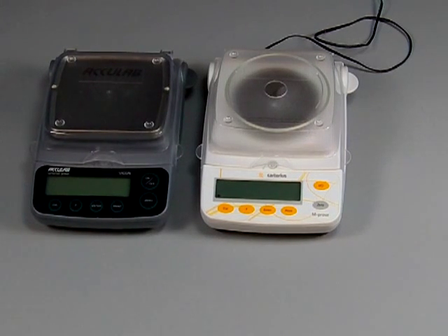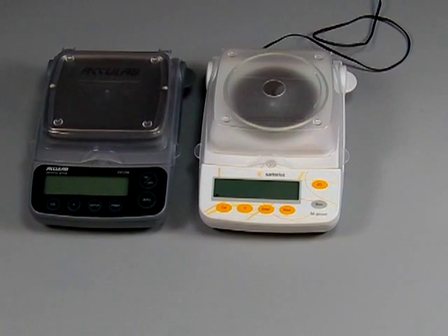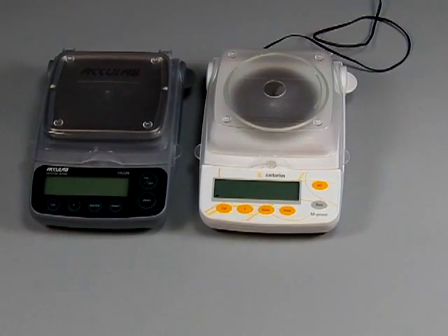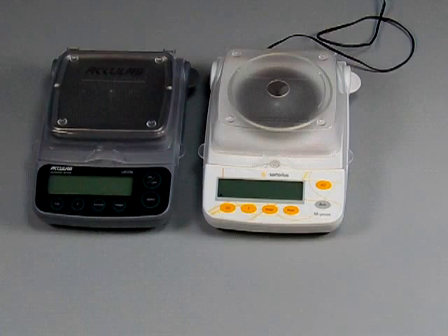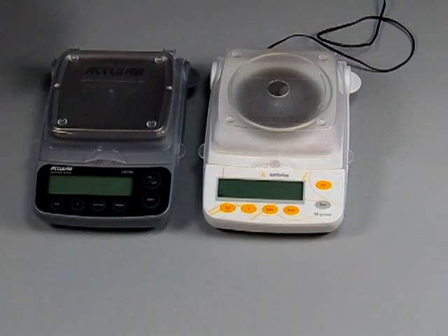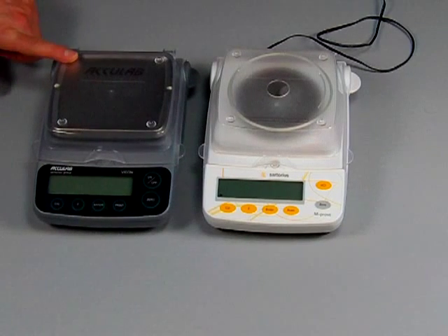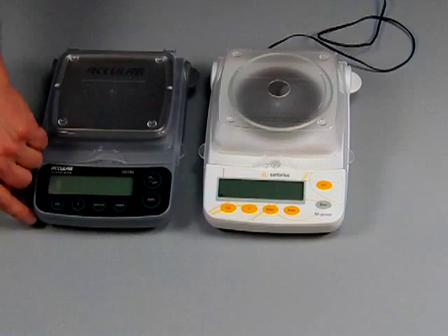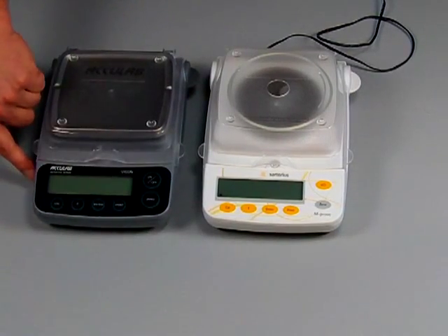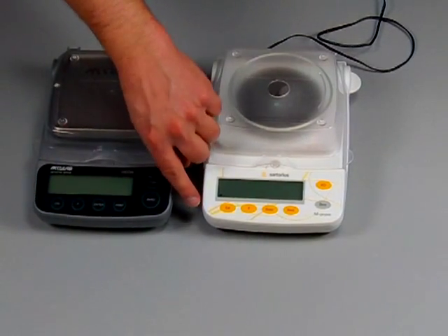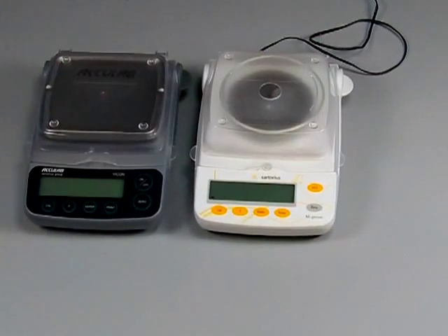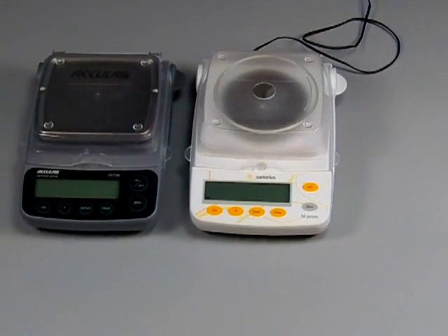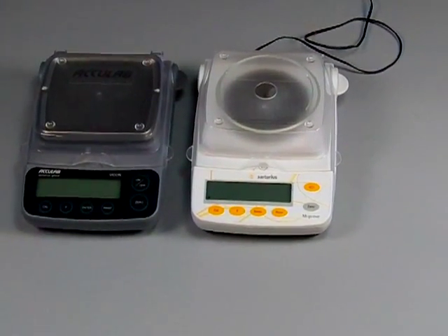Welcome to balances.com. Today we'd like to show you the new Sartorius M-Prove series. Sartorius used to own AccuLab until they shut down the brand, so basically they took the AccuLab Vicon series, changed the color from gray to white, changed the keypad slightly, and of course raised the price. We have no control over this.